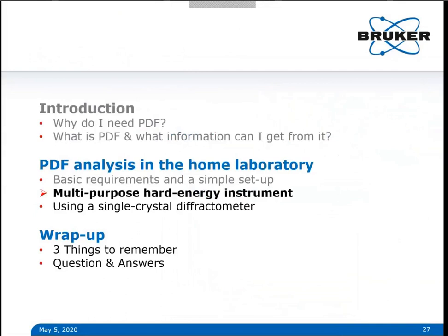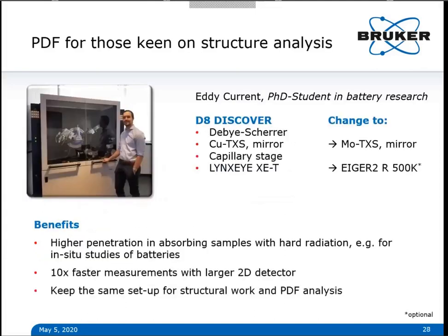Yeah, Michael, thank you for these explanations and walking us through the steps that are required in terms of data collection. I have to say, I'm always still impressed with the data from these pretty simple setups. And the measurements might take a little bit of time, but with the variable counting time strategy, it's actually pretty manageable. So thank you very much. So let's move on and take a look at a multi-purpose hard energy system, and let's see how PDF can work here.